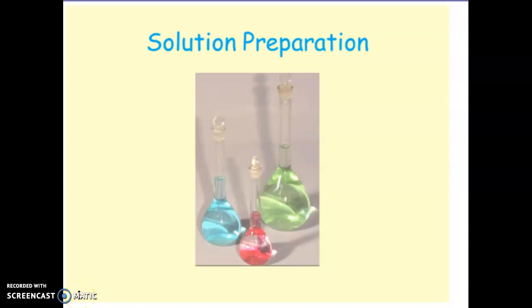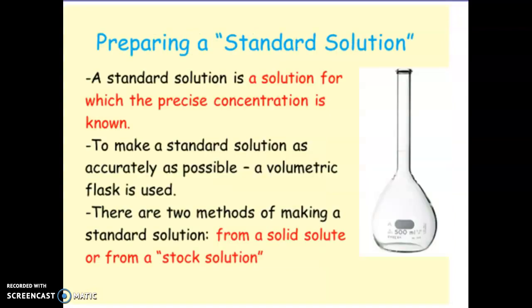Okay, everyone, so today we're looking at how to prepare a solution. If we want to make an aqueous solution, how can we actually do it? There are two ways that we can prepare a solution, so we're going to go through both.